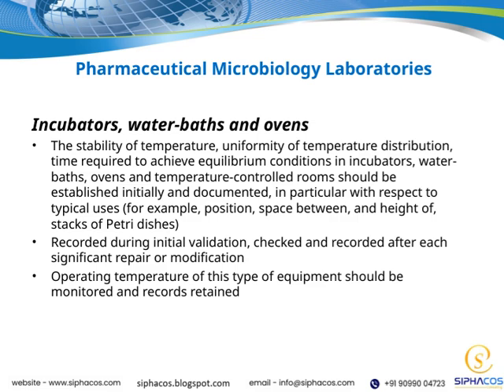It's also essential to perform these checks during the initial validation process and to keep records after any significant repairs or modifications. This helps ensure that the equipment continues to perform as expected.